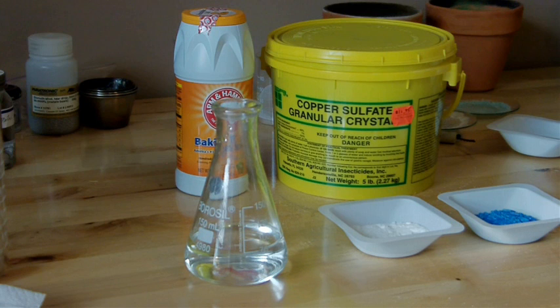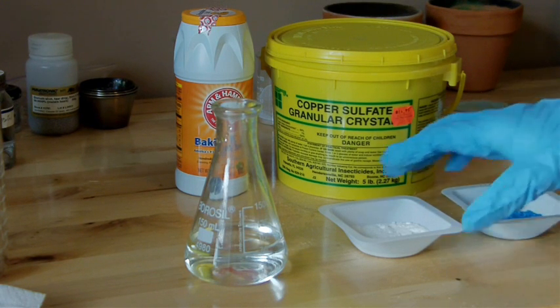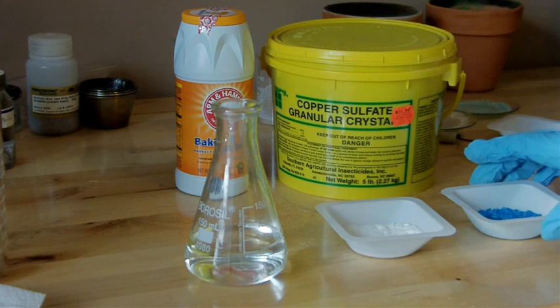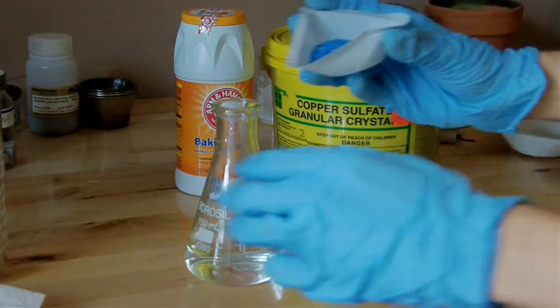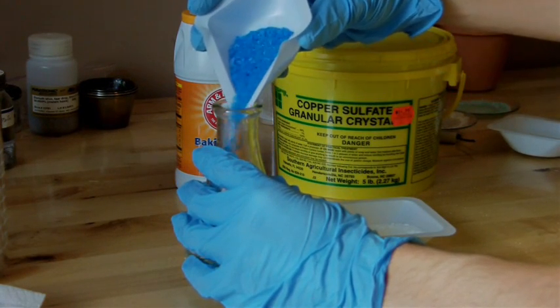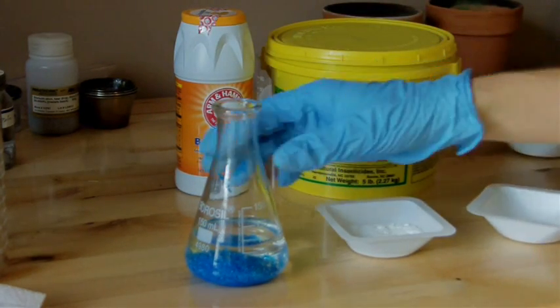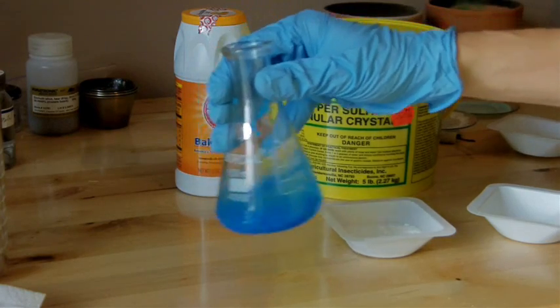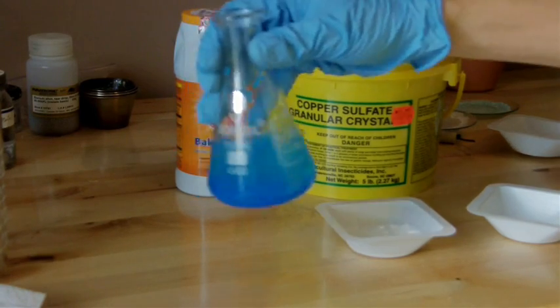The first step is to combine copper sulfate with household baking soda, sodium bicarbonate. I have 30 grams of copper sulfate crystals — you can see they're a very nice blue color — and 20 grams of baking soda. I'm going to dissolve the copper sulfate into a solution of about 75 milliliters of water. Copper sulfate is very soluble in water, so you shouldn't need too much to dissolve a good amount of it. You can see it's already starting to turn the solution blue.